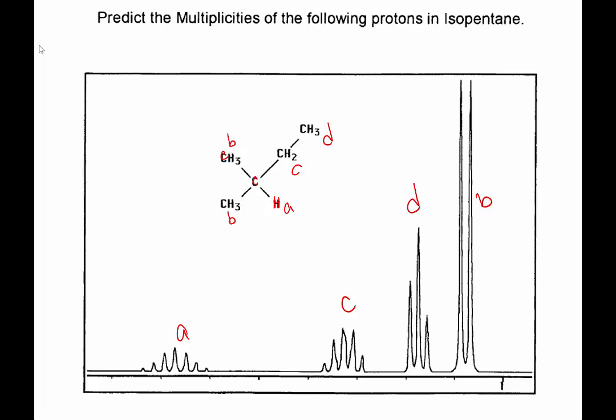And the problem is that there's limitations to when you're going to see nice, clean splitting patterns.